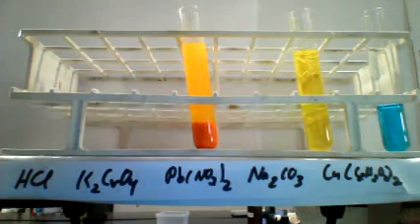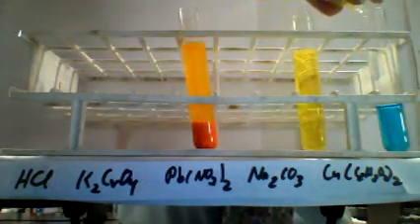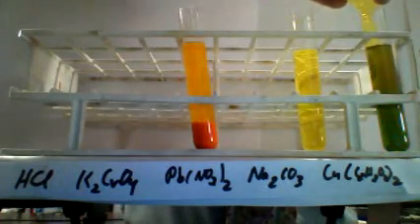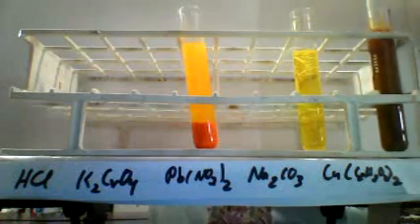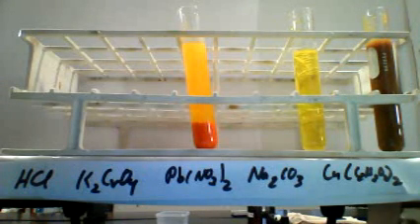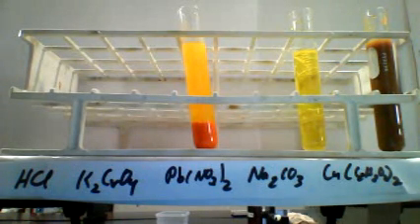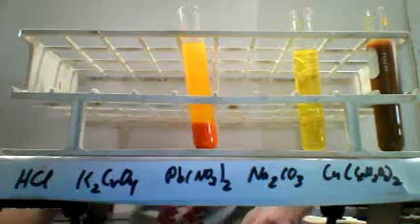So we mix the solutions together and see what happens. And so we want to go on to the next row on our data table.